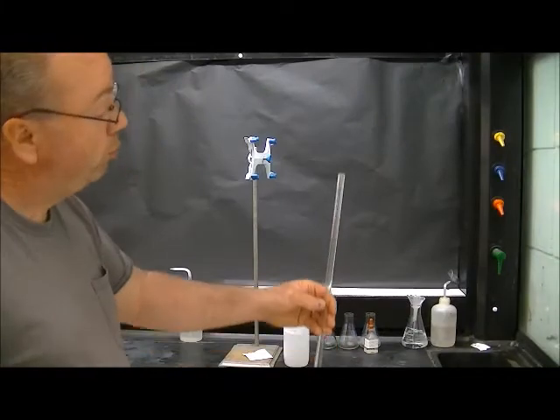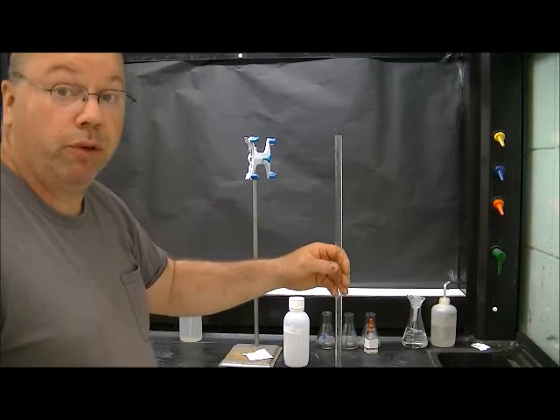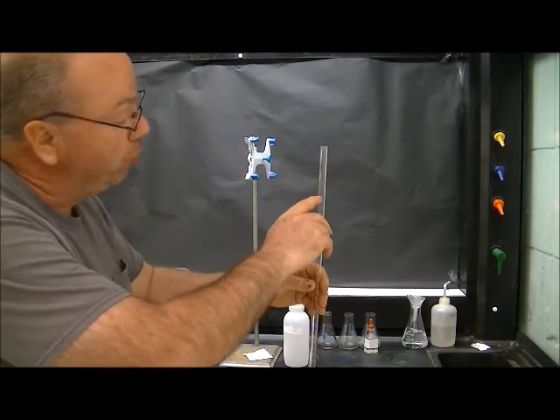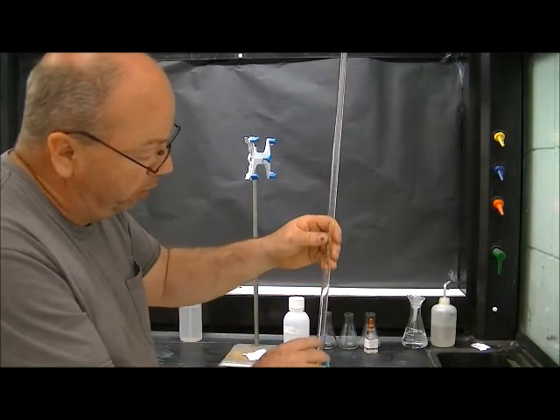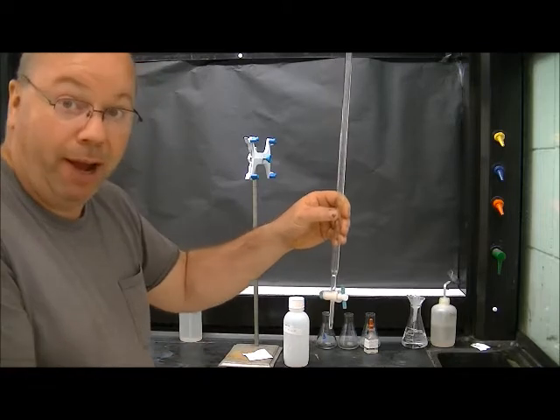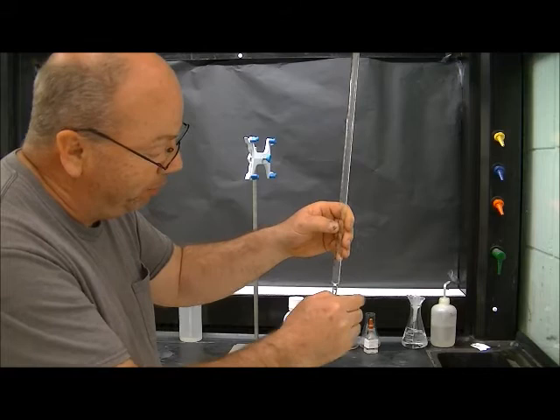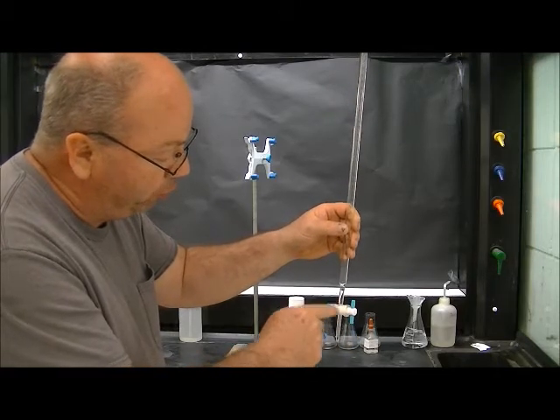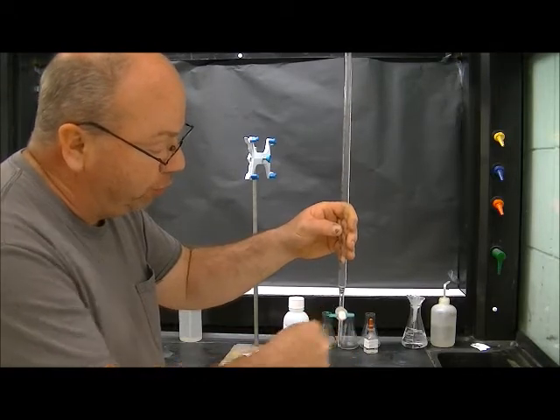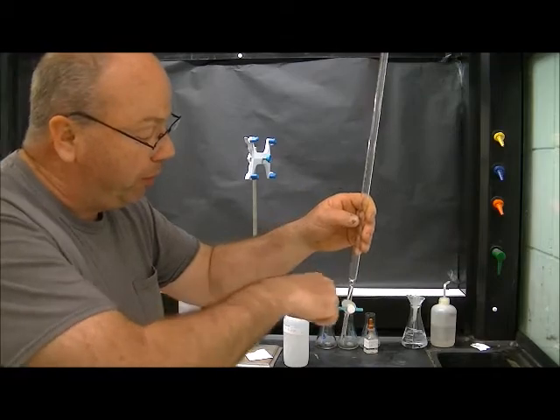So this is the burette that we're using today. It is a 15 milliliter burette. At the very top is zero and it is graduated down towards the bottom at 50. Below that it has a valve called a stopcock. When the stopcock handle is up and down the hole through here is also up and down and that valve is open. When that stopcock valve is turned sideways the hole is across and fluid can't flow through it.